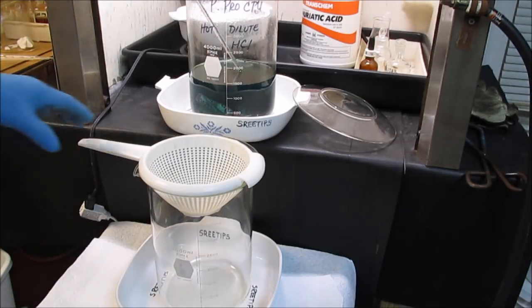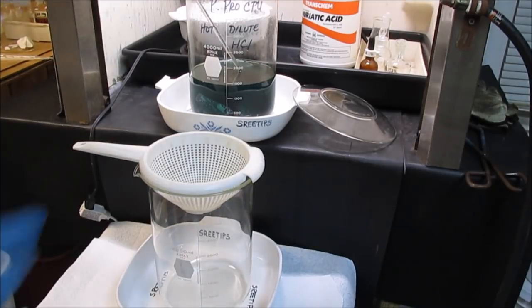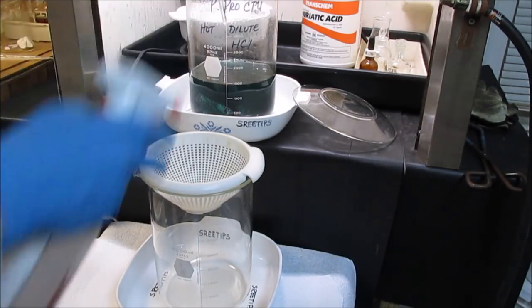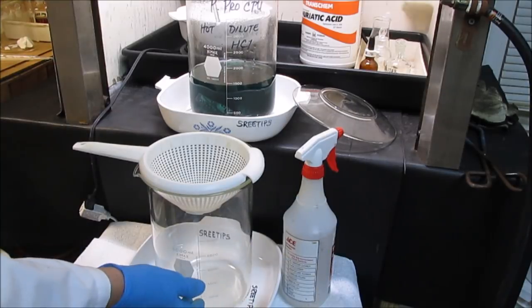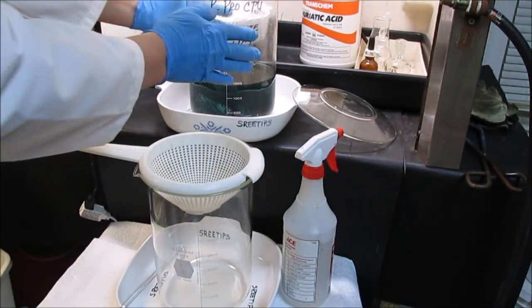What we'll do now is I've got a kitchen strainer here on a 4-liter beaker. I'm going to pour the contents of this beaker through the strainer, trying to get the gold foils to collect in the bottom of this beaker right here. I want everything going through the strainer and collecting in the bottom of this beaker.